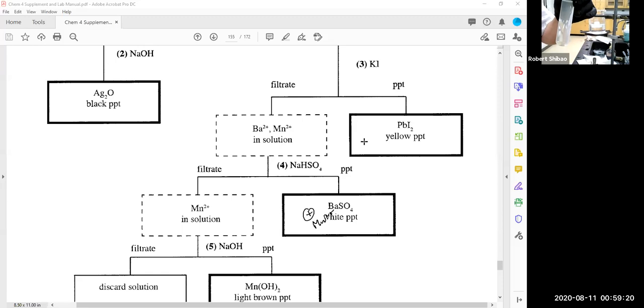That could just be silver chloride that is precipitating out. Well, let's try the sodium bisulfate and see if we get any barium precipitate there. I'm just going to do 2 squirts, otherwise it's going to get too dilute. And nothing, no precipitate here. And so we got negative for lead, negative for barium.